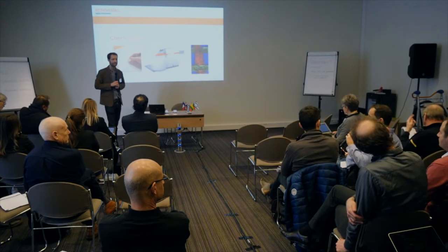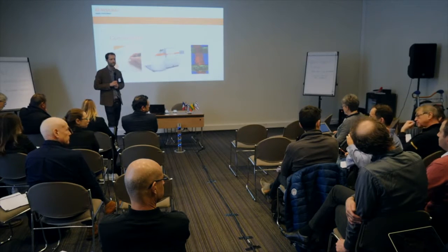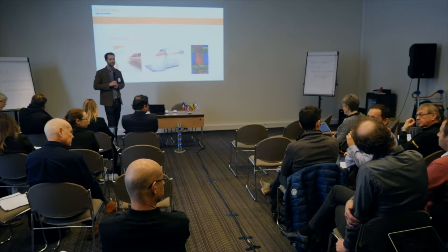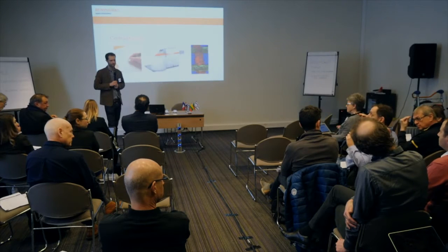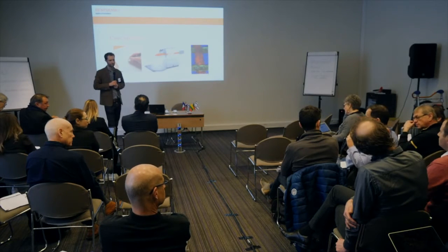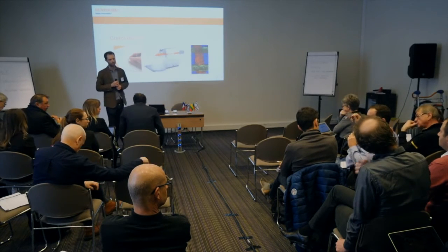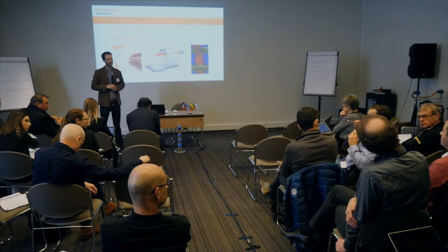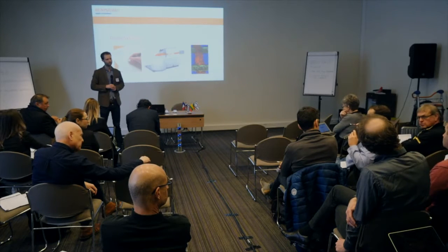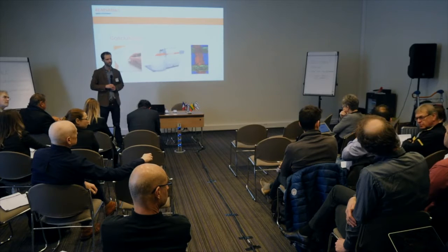Yeah. Well, from my point of view, I'm not sure if maybe I don't understand very well, but is it necessary to be exactly centered on the detected particles? Because if you are just coming back to the same field of view in the camera field, that means if you have a 5 microns error or even 7 microns error, it's not really a problem because you can reposition the particles on the field of analysis of the spectro.